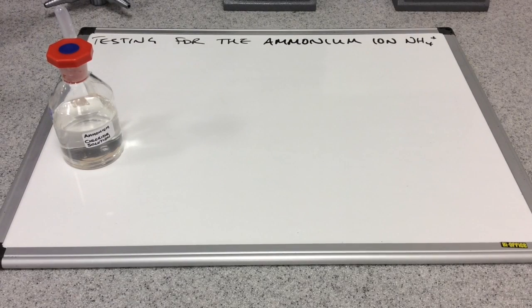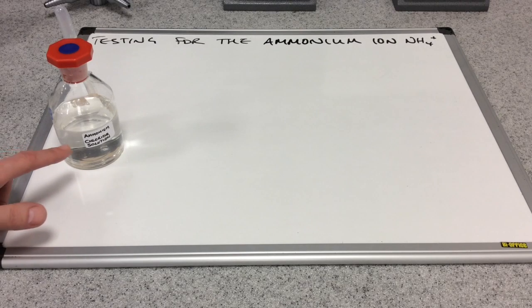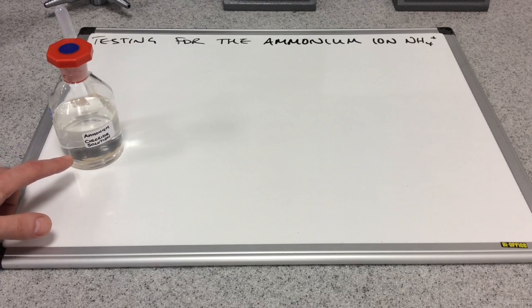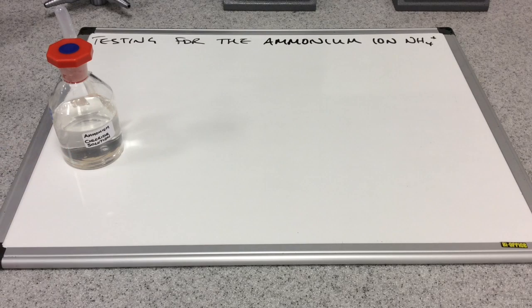In this video I'm going to look at how to test for the ammonium ion. In the bottle I've got some ammonium chloride solution, and obviously contained within that is the NH4+ ammonium ion.